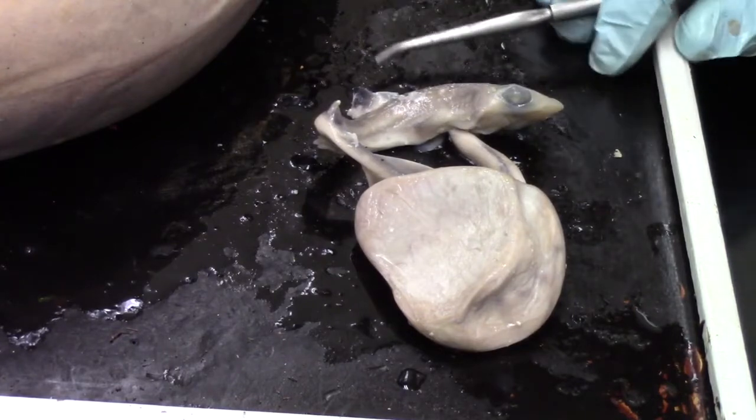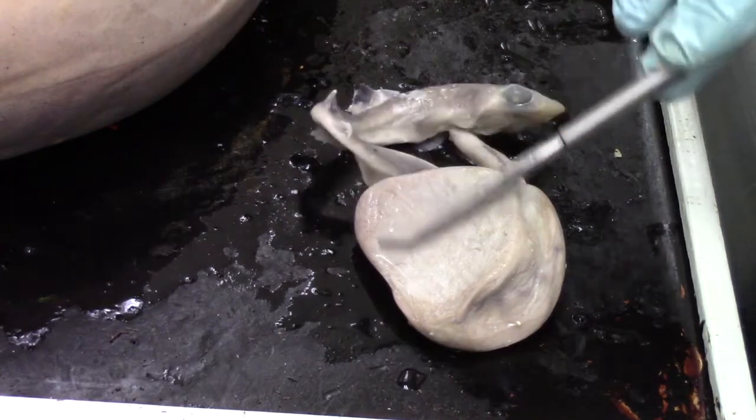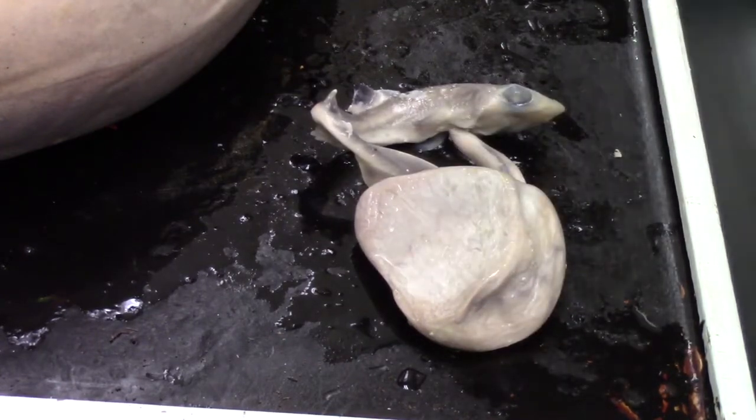So dogfish undergo a reproductive technique that's known as ovoviviparous. What that means is that if they were oviparous, that would mean that they would lay eggs. As an animal that's ovoviviparous, they release their eggs from their ovaries. They will have internal fertilization, and those embryos will develop inside the mother. However, the embryo is getting all of its nutrition from this yolk sac and not directly from the mother. There's no placenta and there's no nutrient exchange between the developing embryos and the adult female.